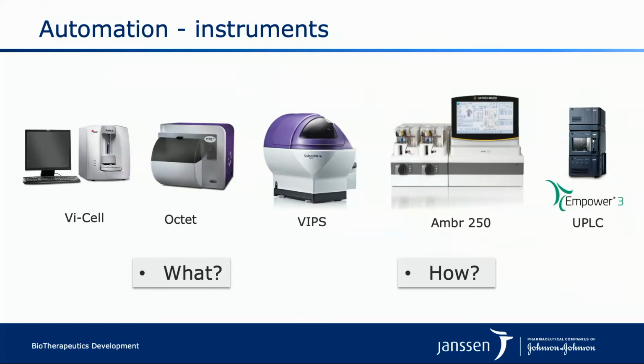Another one is always our end goal: trying to connect all the different instruments in the lab, to get the data directly, but also link it so the system knows where the sample comes from, where the lineage comes from, or what information we're extracting from this.